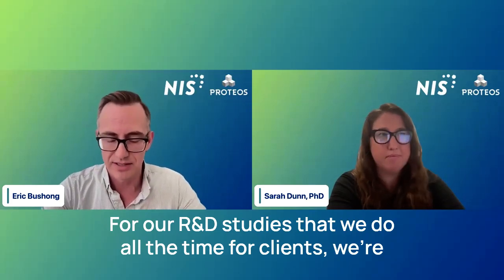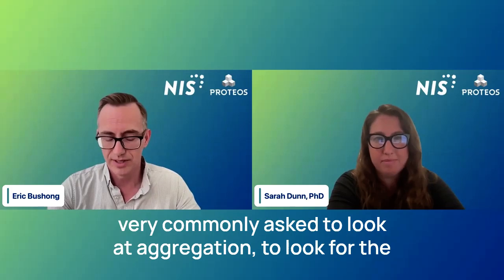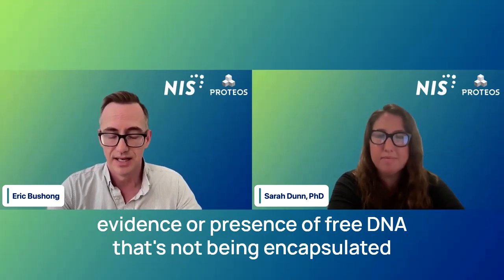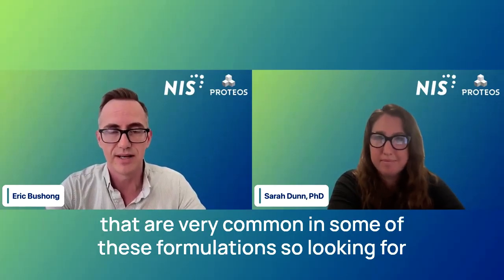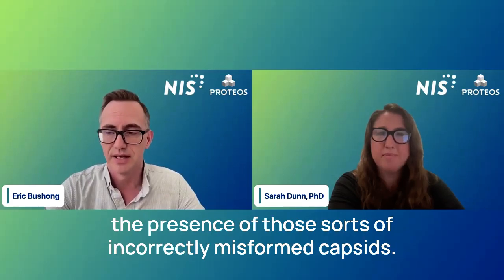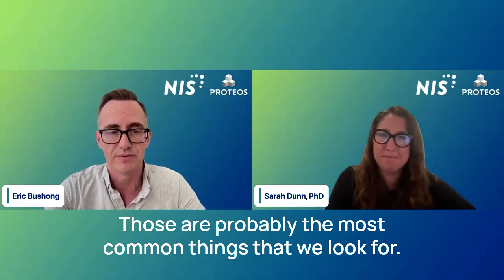For our R&D studies that we do all the time for clients, we're very commonly asked to look at aggregation, to look for evidence or presence of free DNA that's not being encapsulated, and for broken or malformed particles. Dimers and things like that are very common in some of these formulations. So we look for the presence of those sorts of incorrectly formed capsids. Those are probably the most common things that we look for.